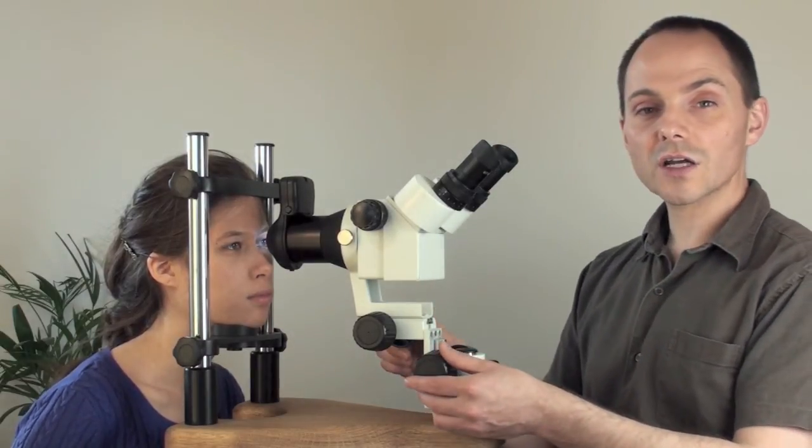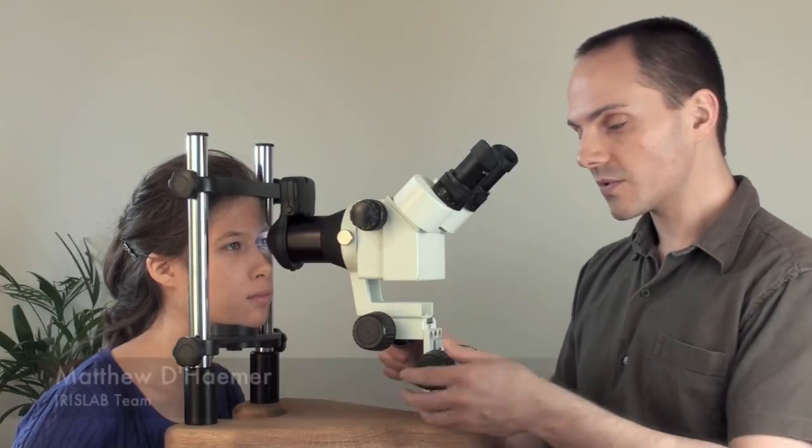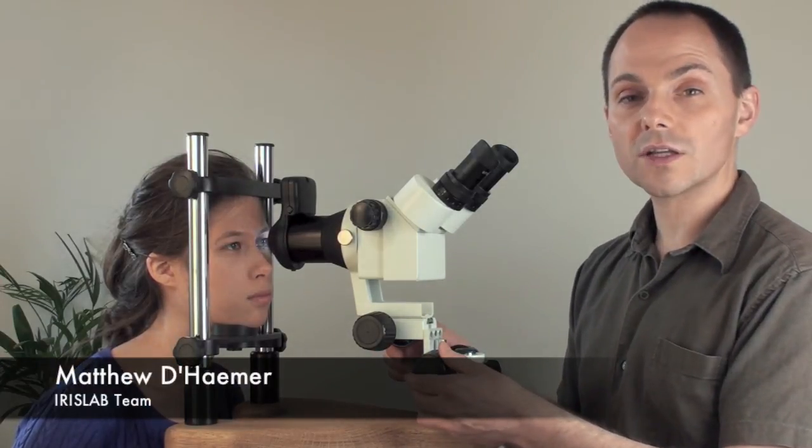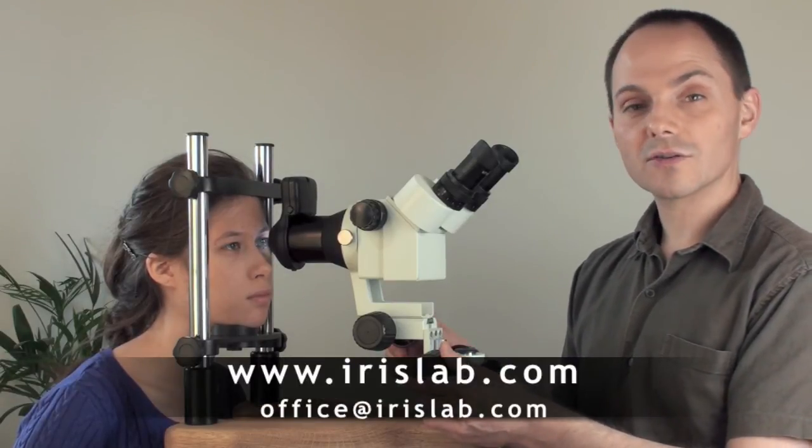So this is a quick introduction of the Iris Explorer mounted on the camera and on the microscope. There'll be some more detailed videos showing exactly how to use them later on. Thanks a lot.